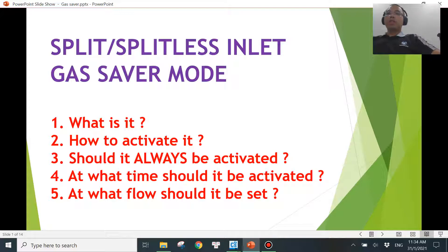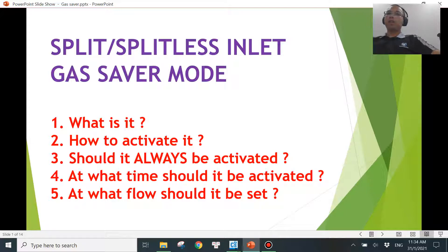All right, so let's get into this video. We'll be answering the first two questions, and a couple of other videos will be answering the rest of the questions listed here. So let's jump right into what is gas saver mode.